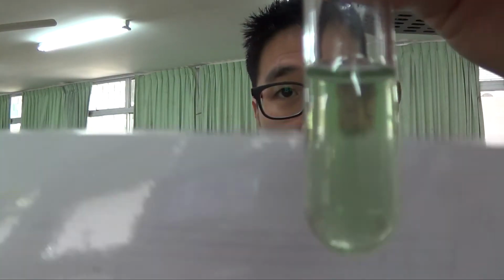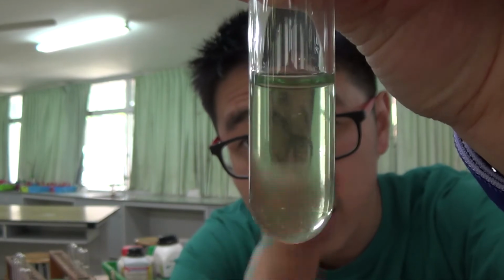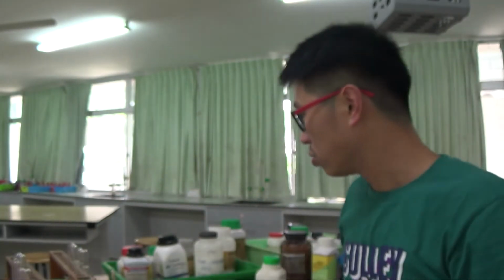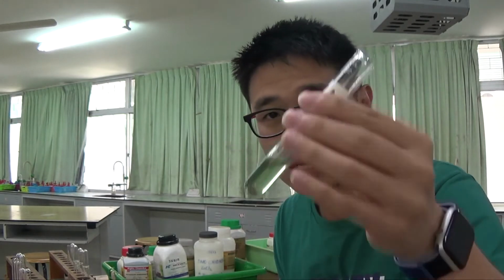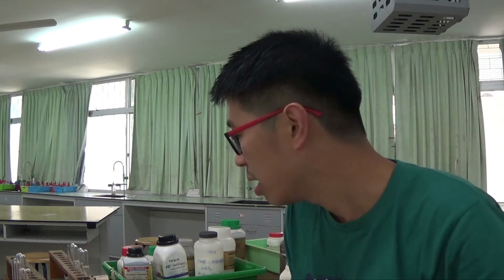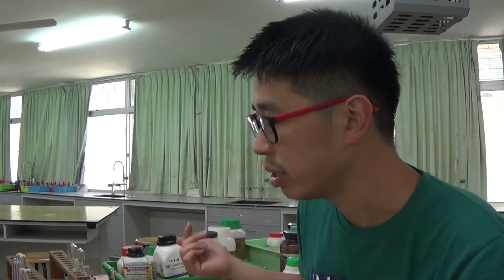Oops, sorry. Okay, so it looks like there is a little bit of solid in there. It's not very clear. I know what I should do. What I can do is add a little bit more of the chromium 3+ to this. This is what I meant by the actual exam. They will give you a more concentrated solution according to Cambridge standard.